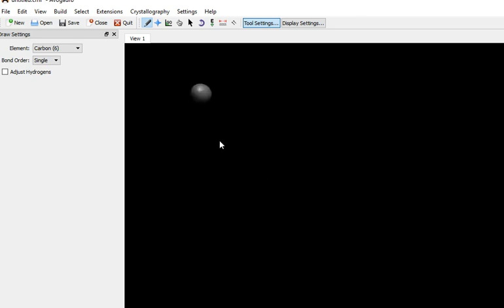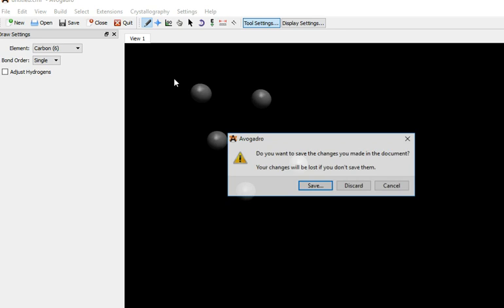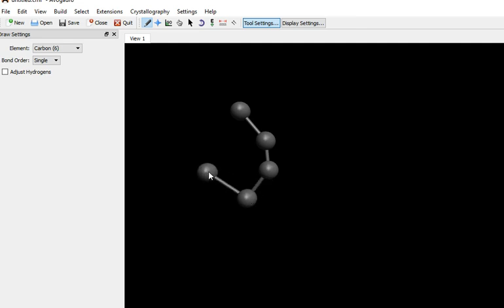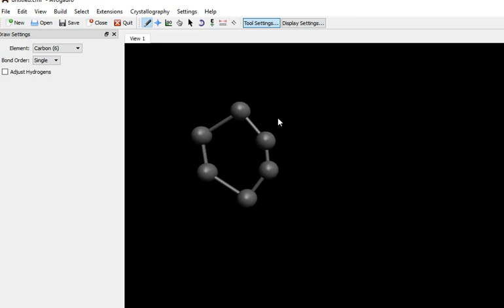So a left click just creates carbons. But left click and drag will create chains and cyclics. Don't worry about that, we can sort that in a minute.